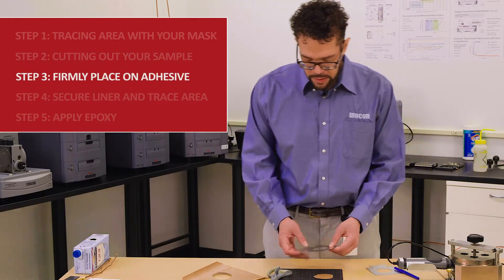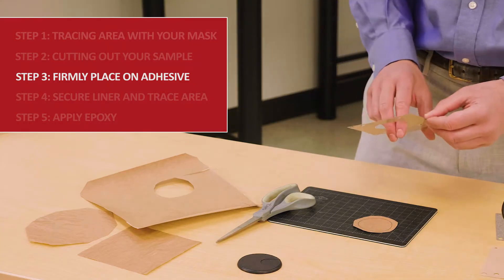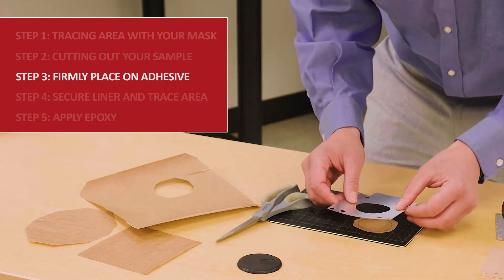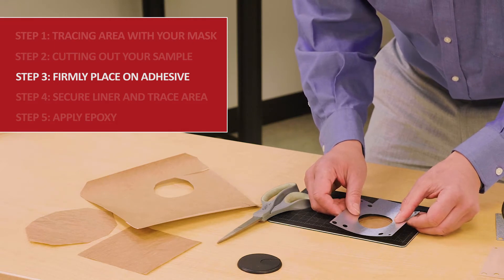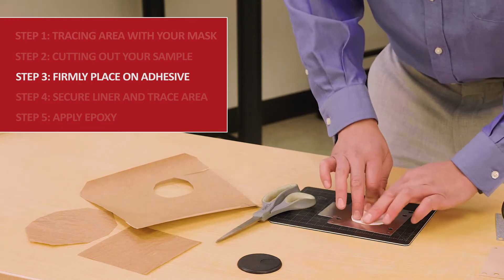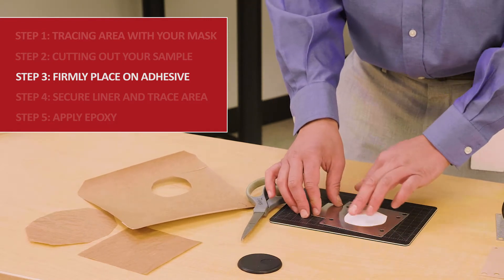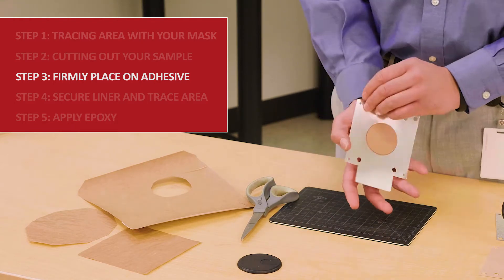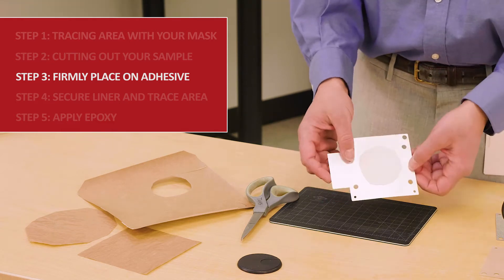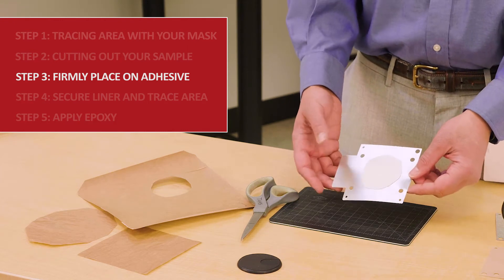I lay the cut sample down, then take the mask and remove the adhesive liner on the back. I line up the circles — my traced circle to the actual orifice on the mask that defines the test area. I lay it down and use my thumb or finger to create a good bond on the adhesive. This side — the nice smooth side — is what seals to the instrument, and the other side is what gets the test gas challenge, whether that's oxygen, water vapor, CO2, or otherwise.